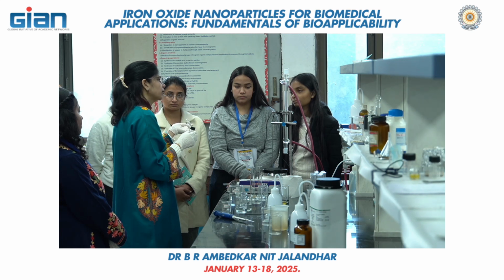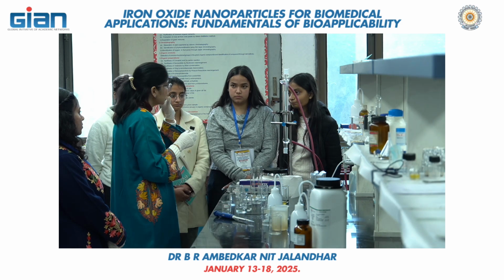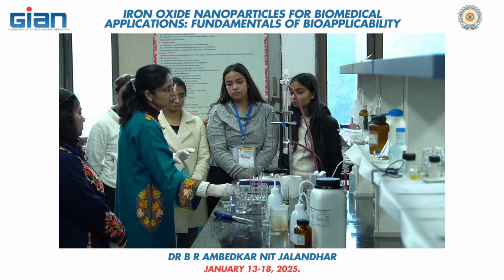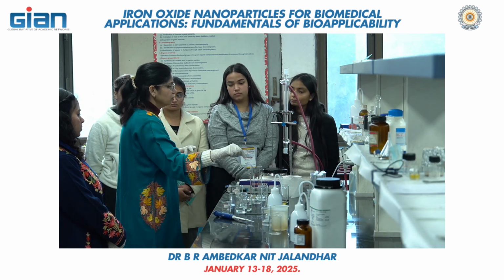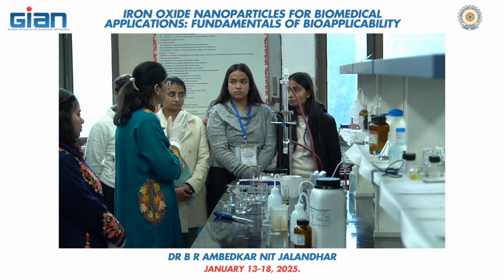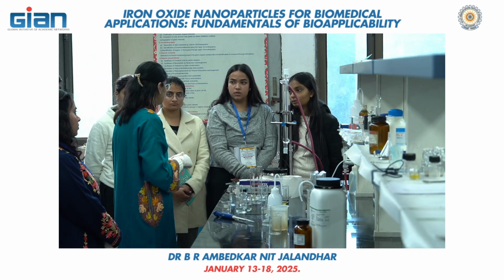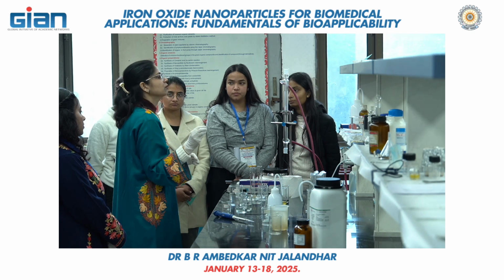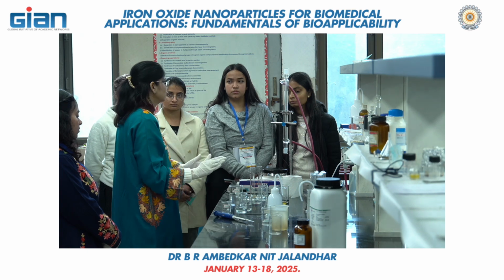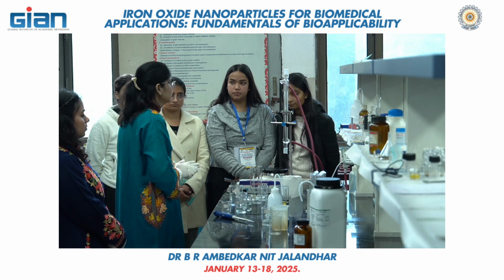That iron oxide, synthesized in tutorial number 4, will be used in tutorial number 5 for the extraction of silver or gold. When you add iron oxide to these suspensions, the gold will be absorbed onto the iron oxide and the solution will become clear. With a magnet, you can remove the iron oxide from the bottle and see the pollutant is removed. So now this silver and gold is acting as the heavy metal pollutant. Okay?